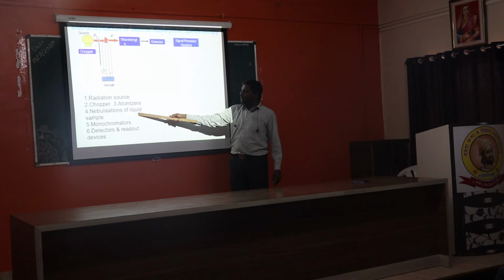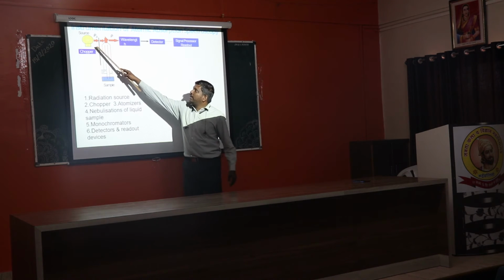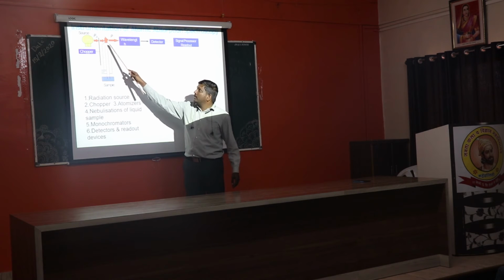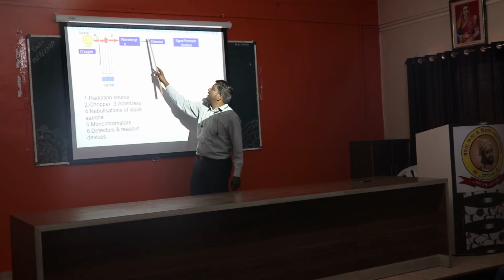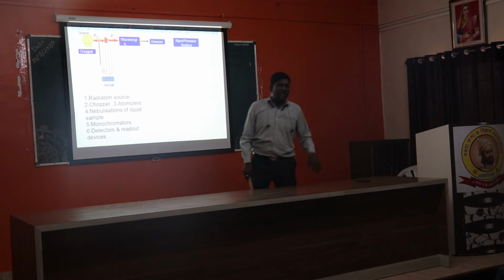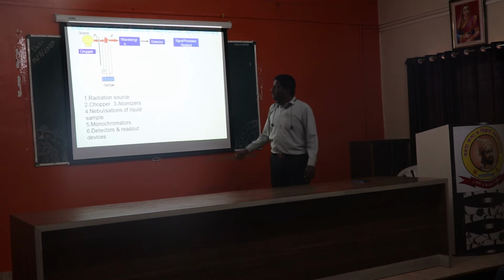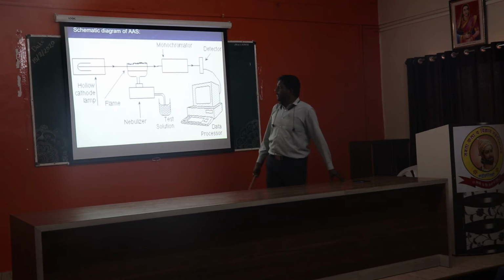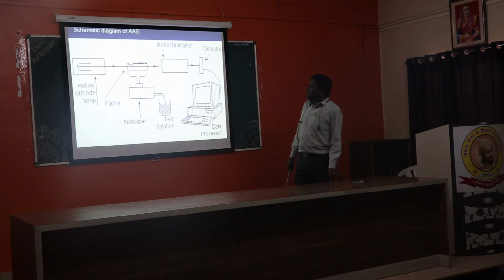Now nebulization of liquid. See here, due to the radiation source, the liquid sample comes from the nebulization. The nebulization process takes place, which is carried to the wavelength detector, and lastly the readout device, where we come to know what the answers are. So this technique is very important, and its instrumentation is also important. Next point, now the schematic diagram of AAS.